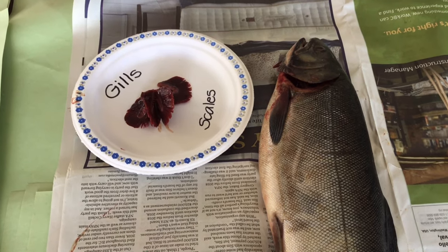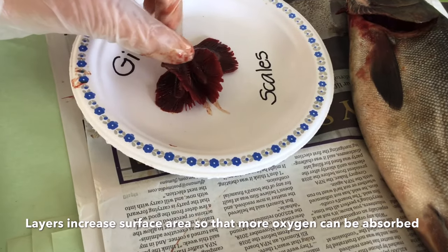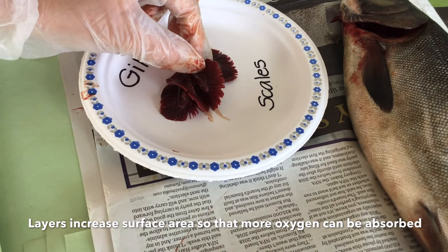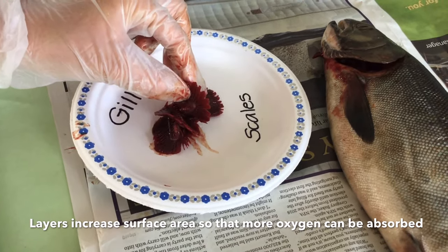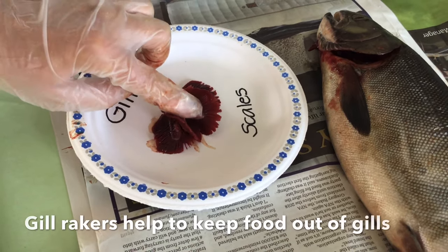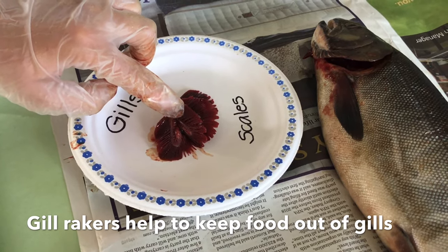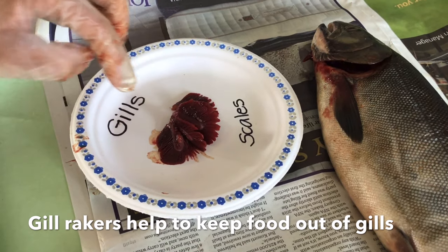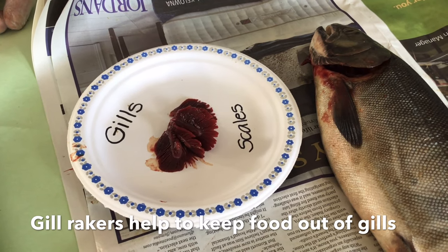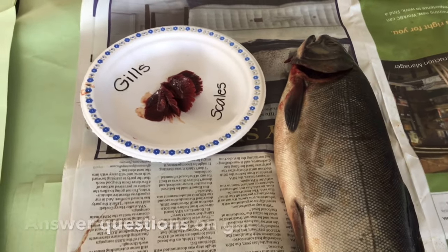Now, the reason they have four layers is because each layer increases the whole surface area of the gill, meaning more oxygen can be absorbed through a larger surface area. Then the gill rakers, which Alicia is touching, help to keep food out of the gills, and they redirect the food to the salmon's throat for it to swallow, because you don't want food in the gills. It'd be like us getting food in our lungs or something. So that is the gills.